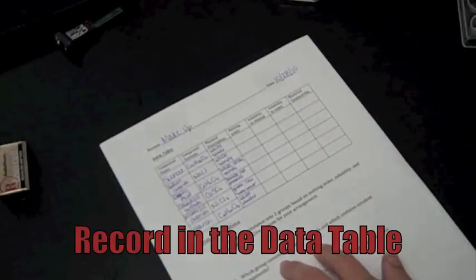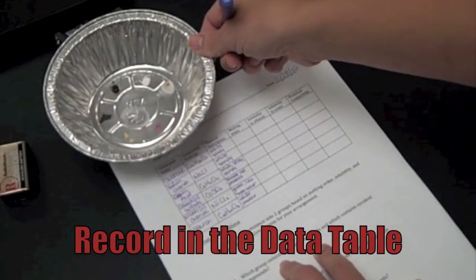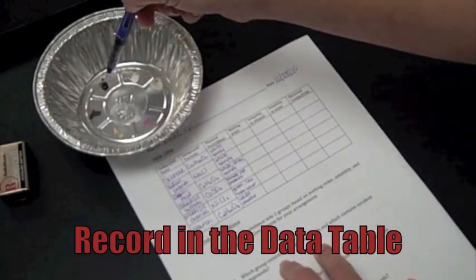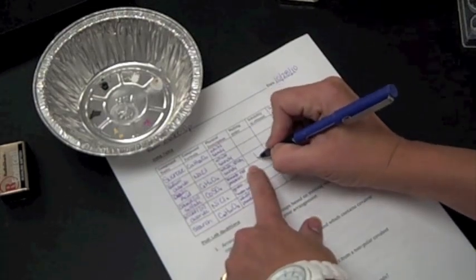So then recording our melting order, looking at my little pie plate pan here. Let's see, I'll put it right there so y'all can see it. Remember, this was one, two, three. Three melted first, so the oxalic acid melted first.